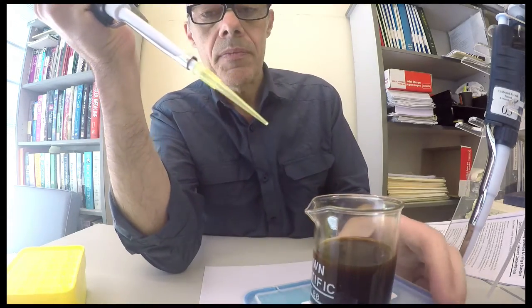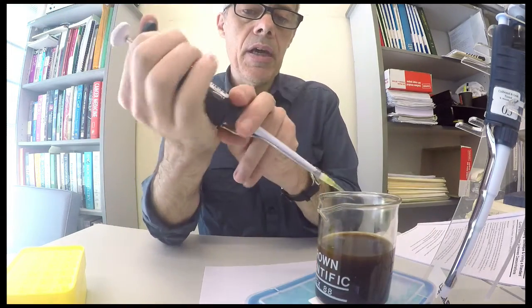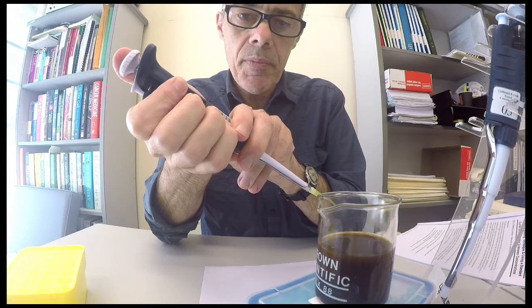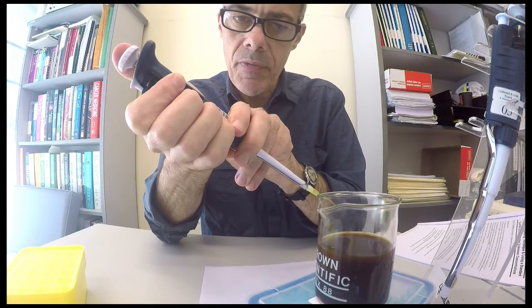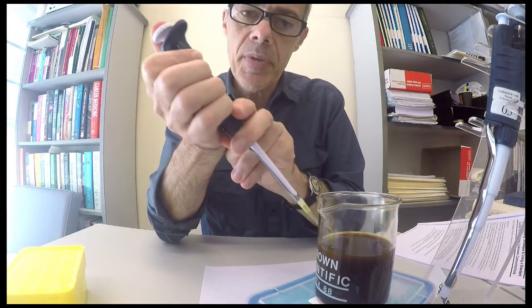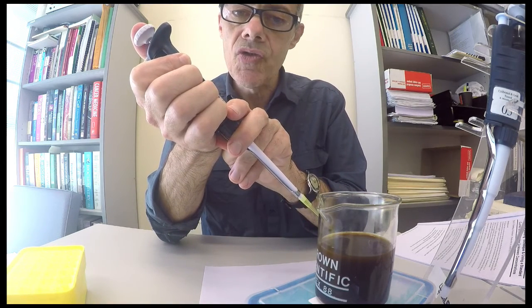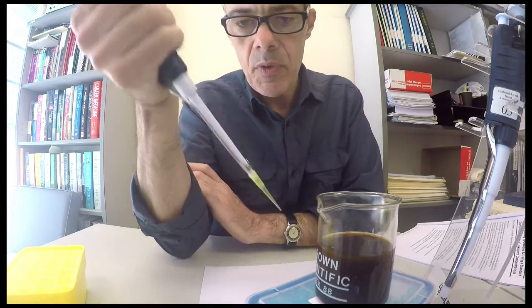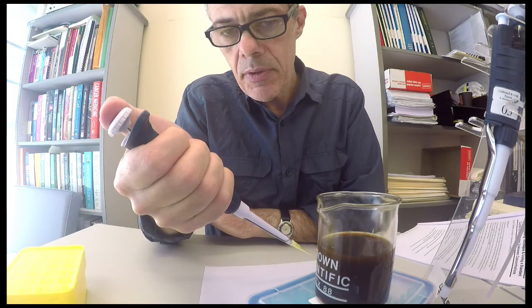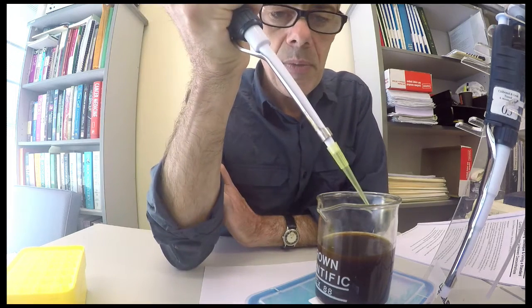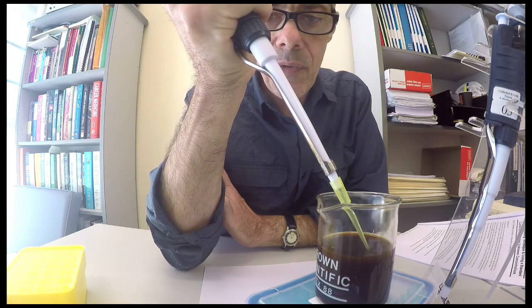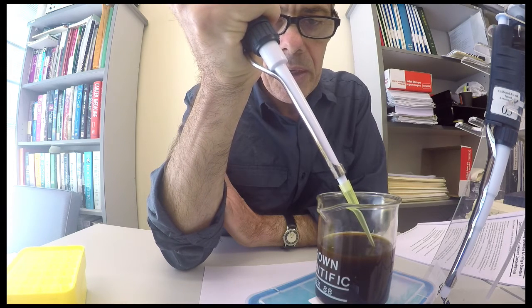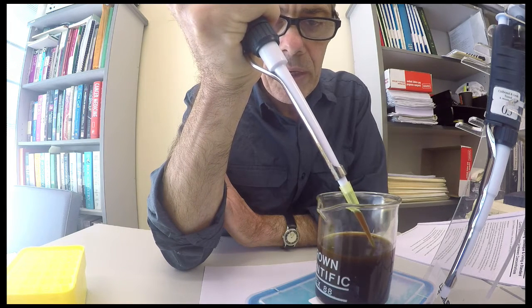So here's the pipette. I'm going to take it down to the first volume, which is the calibrated volume here. I'm going to immerse the tip under the solution, then I'm going to draw the solution up. So I'm dispensing down to the first position, I'm immersing it just below the surface, and then I'm slowly drawing that up.